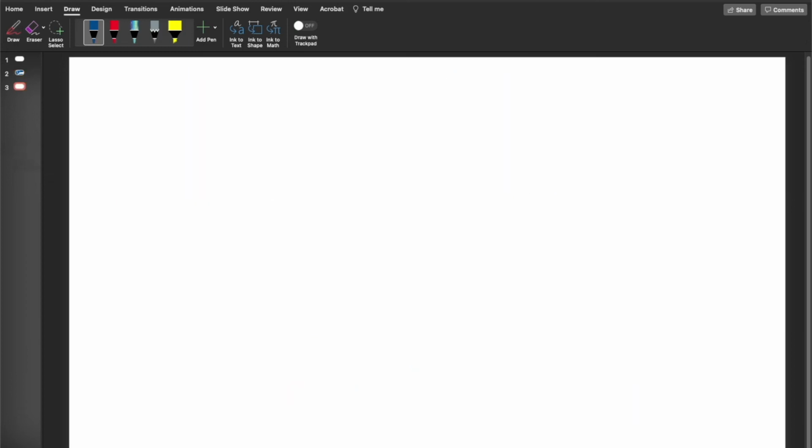So let's keep on moving forward. We're going to go ahead and figure out how to answer number 4. Number 3 just says using the Excel file, plot all your graphs, the trend lines, and figure out your slopes and all that. But we already did that before we got into the discussion questions. So we'll skip number 3 since we've already done it. So we'll go to number 4 now.